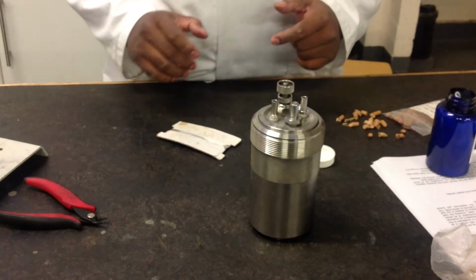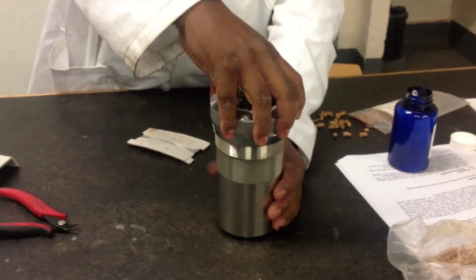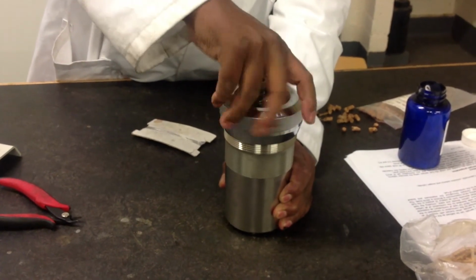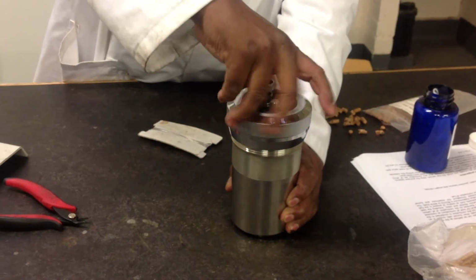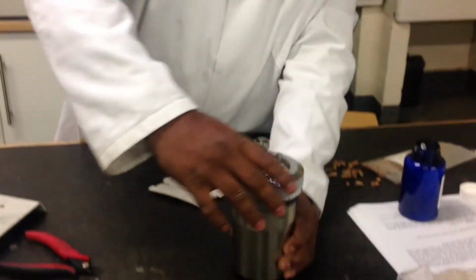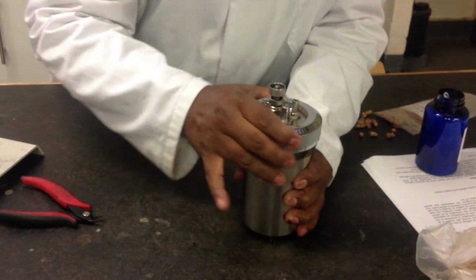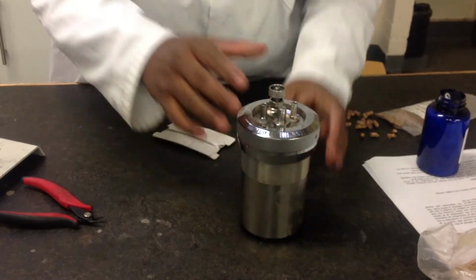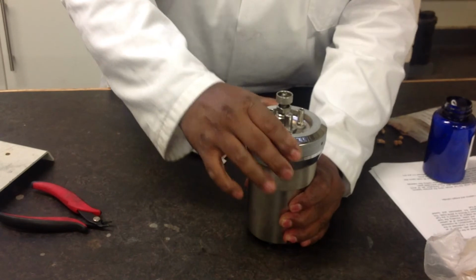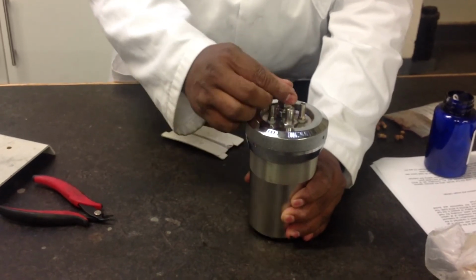Okay, and then close this vessel using the big screw. Don't use any spanner, just hand tight, but make sure it's properly tight. And then after that close this gas release valve. So first the big screw and then the small one.